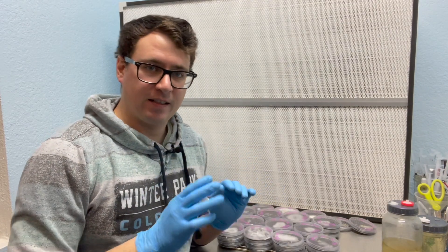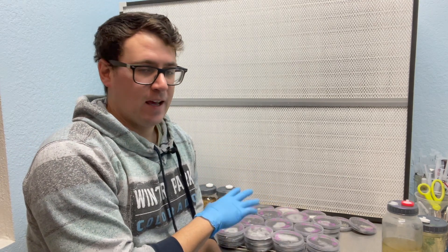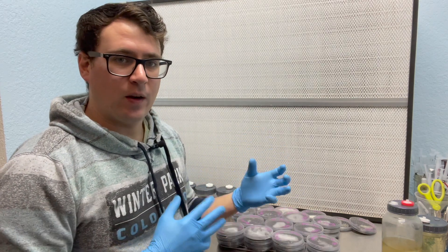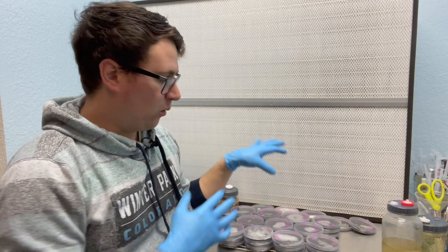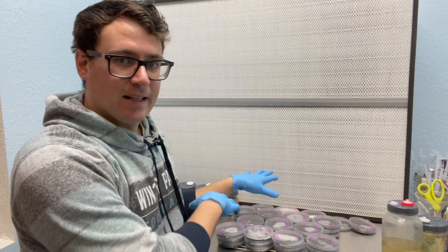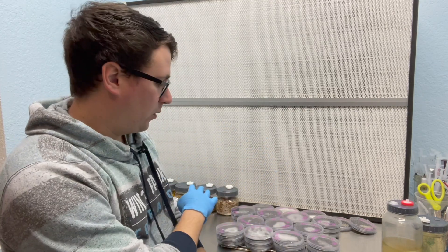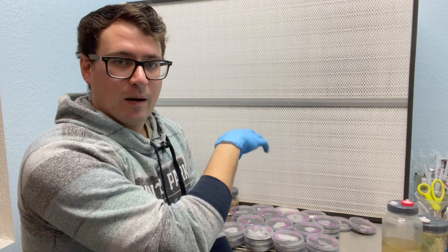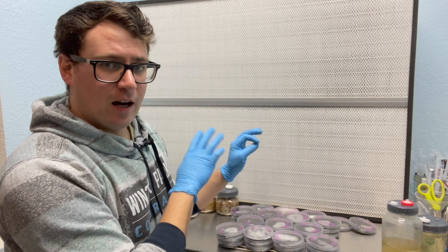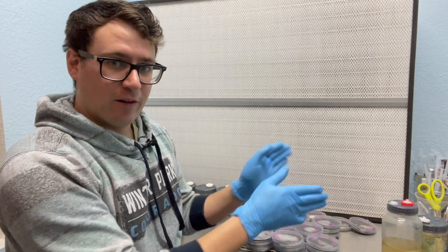So it's been five days since we did our liquid culture quality control test. I'm going to go through these plate reads and show you guys the importance of why we do these tests on every single batch. I'll flip this camera around and go through all the different mycelium, point out what I'm seeing, and something really important on why we do this for every single batch.